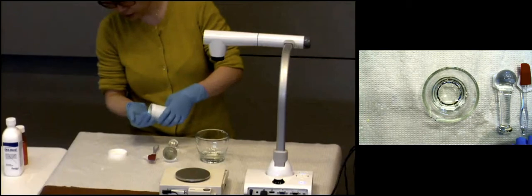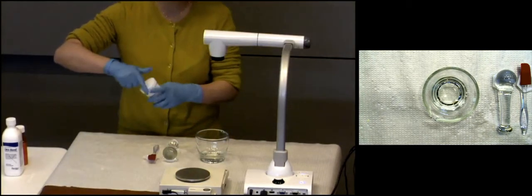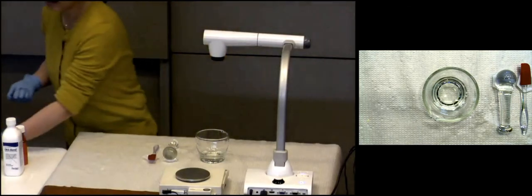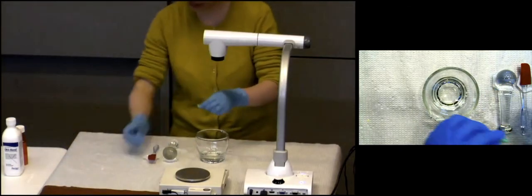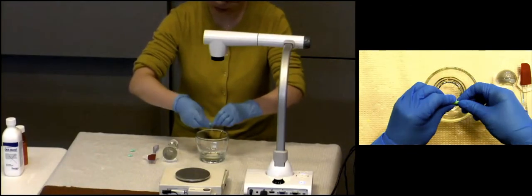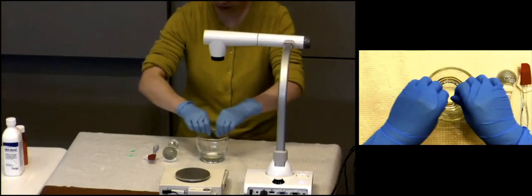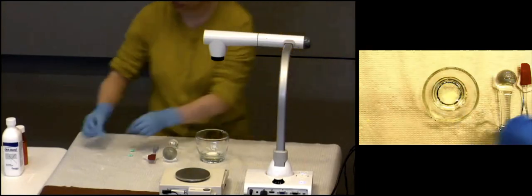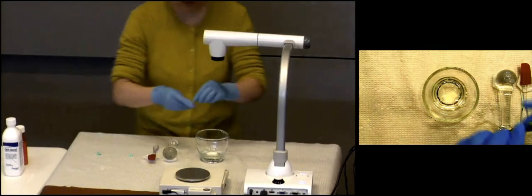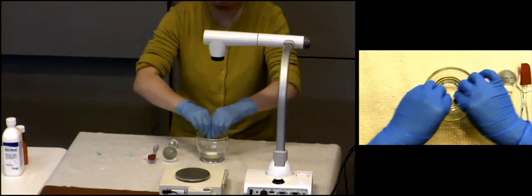So we need 3 capsules. Do I need to measure the weight of the capsule powder for this? Wait a minute, why not? You did when we made capsules. Why don't we need the weight of them here, even though we used an even 3 capsules sometimes? How do we dose capsules? They're dosed on weight, right? Didn't we weigh your capsules at the end? How do we dose suspensions? Volume. We dose them on volume. So we don't worry about the weight of that powder.